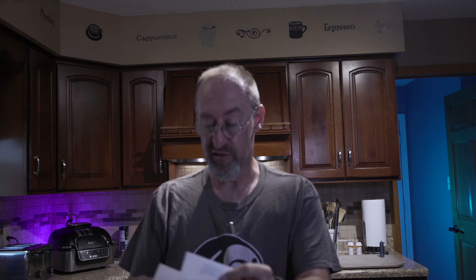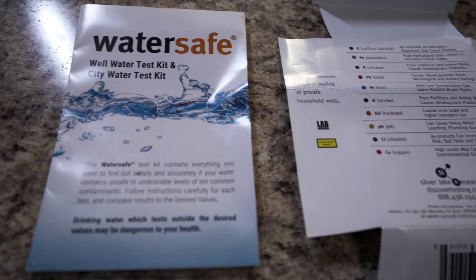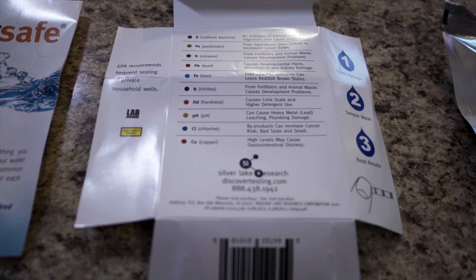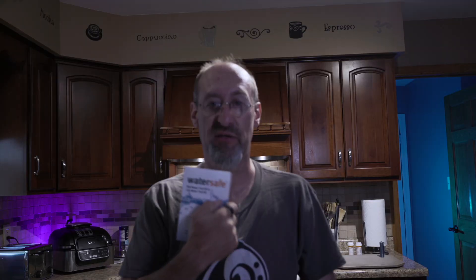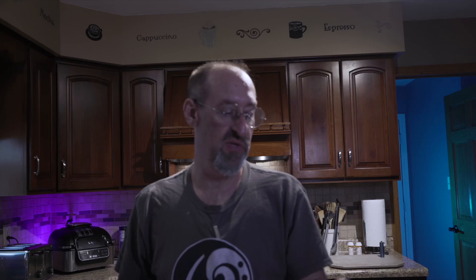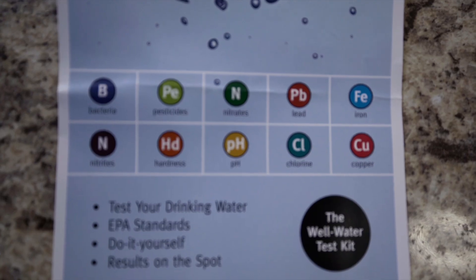Let's look and see what's inside this test kit. It comes with a bunch of instructions telling you what all the different tests are. The instruction booklet tells you your parts per million, where you should be, how to test the water, and how to interpret the results. It also comes with a card showing you which tests it checks for.